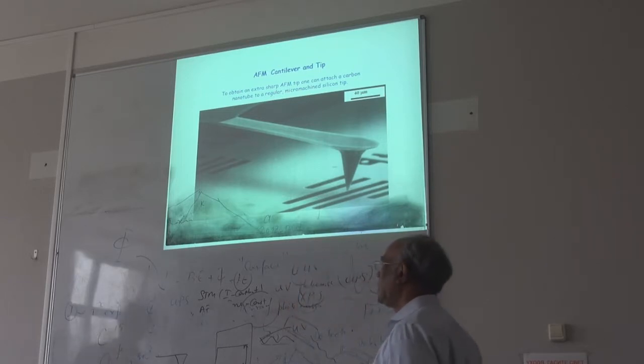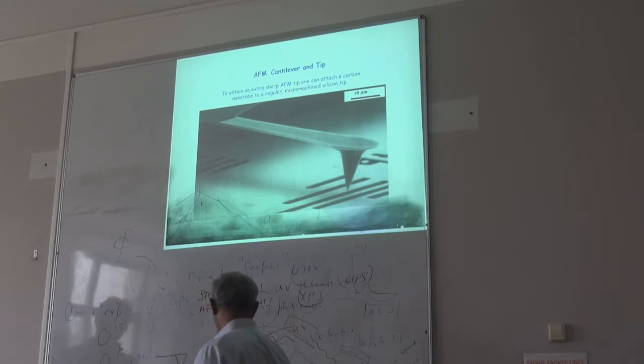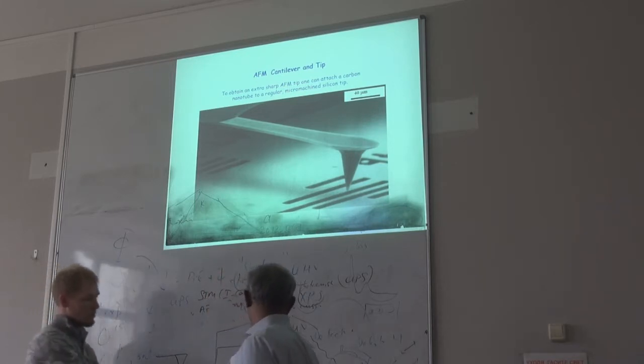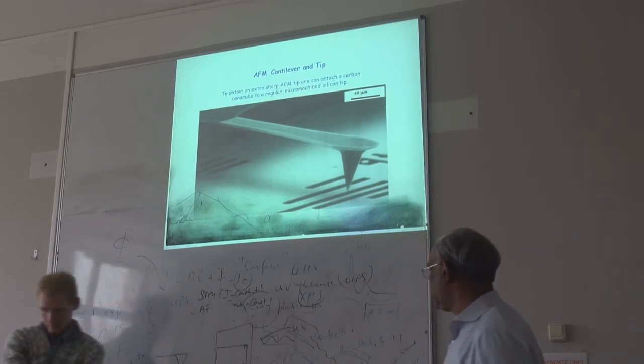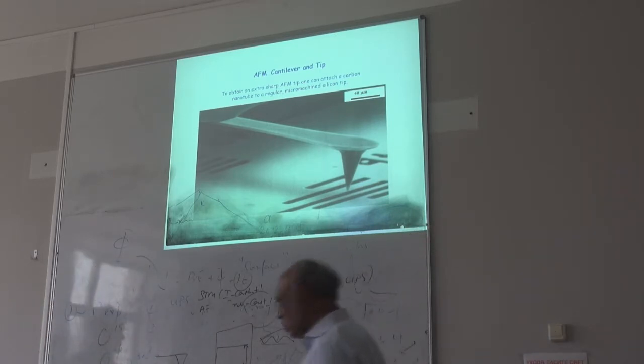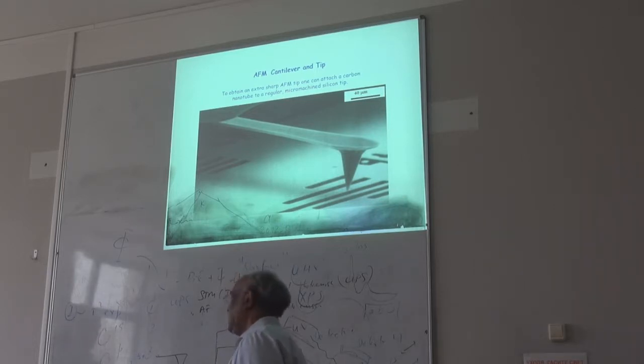And what is the typical area? Typically, with the one we have, we can do about 20 micrometers, or 30 maybe. 30 micrometers by 30 micrometers. It's big if you are working with nano. Yeah, we don't need that much. But typically, if you want to get this height, we like to get the height from both ends, this one and this one. Then it's more accurate, right? Not from one end. That's how we do it.